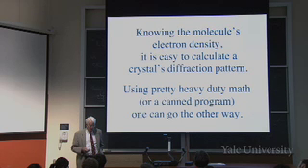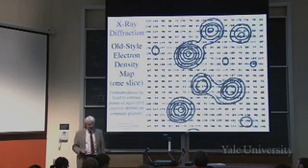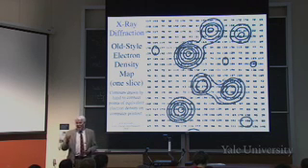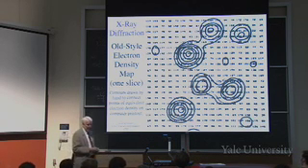You can go the other way and go from the X-ray pattern to what was causing it, right? What we did was go from what's causing it to the pattern. But in fact, you can go the other way now when you press a button on a machine. And you get out the electron density at every point in space. Okay, that's the yield from an X-ray structure.